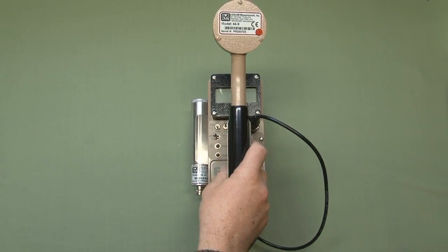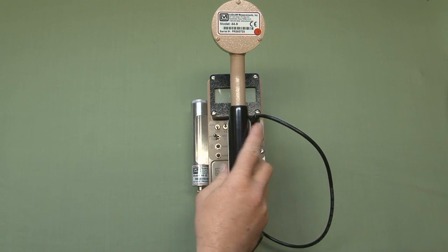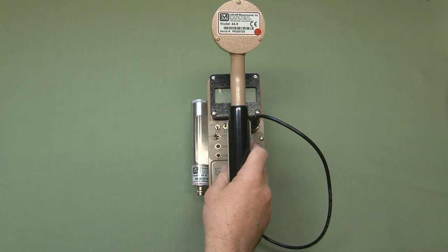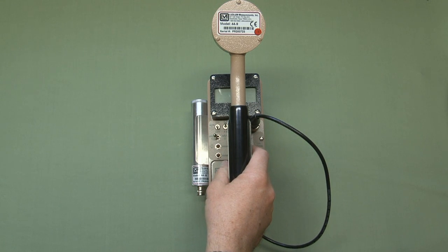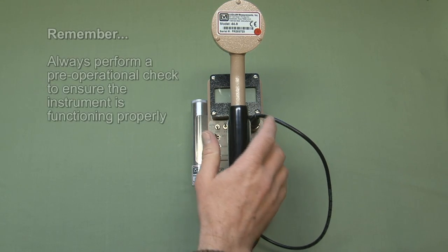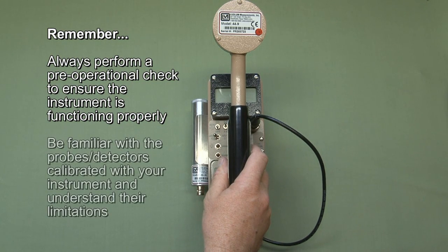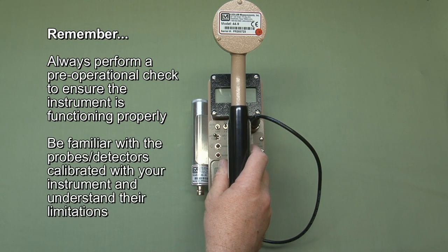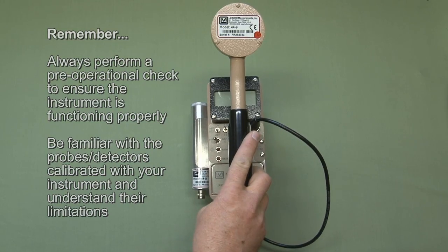That should give you a pretty good overview of the Ludlum 2241-2. There's a lot more to this instrument that hasn't been covered in this short video. It's important to be familiar with your instrument's capabilities, how to perform an operational check prior to each use to make sure it's functioning properly, and most importantly, be familiar with the detectors calibrated with your instrument and know their limitations, as those are most likely going to be the most limiting factors when using the instrument.